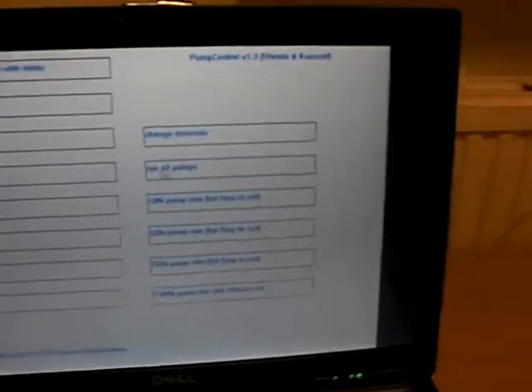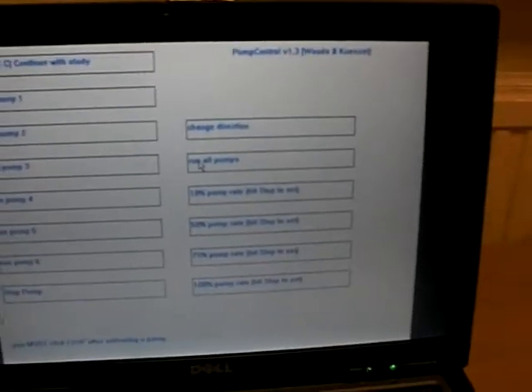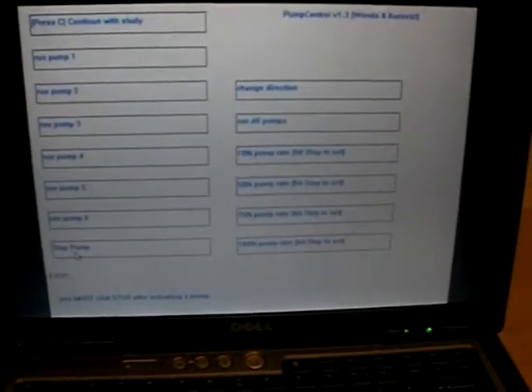So we had to remove all the air from the ends of the syringes. This is important because it helps with accuracy, as any air bubbles in the syringes will replace water content in the individual drink, which leads to inaccuracy. So we click run all pumps. We wait until all the air bubbles have disappeared, perhaps a few seconds, then we click stop pumps.